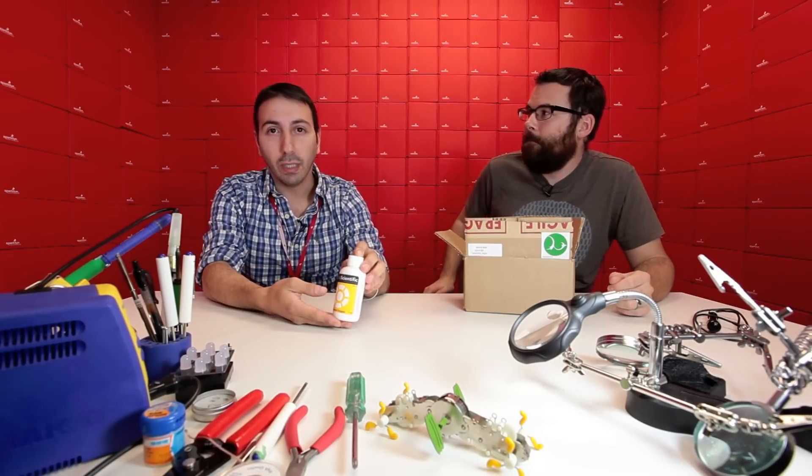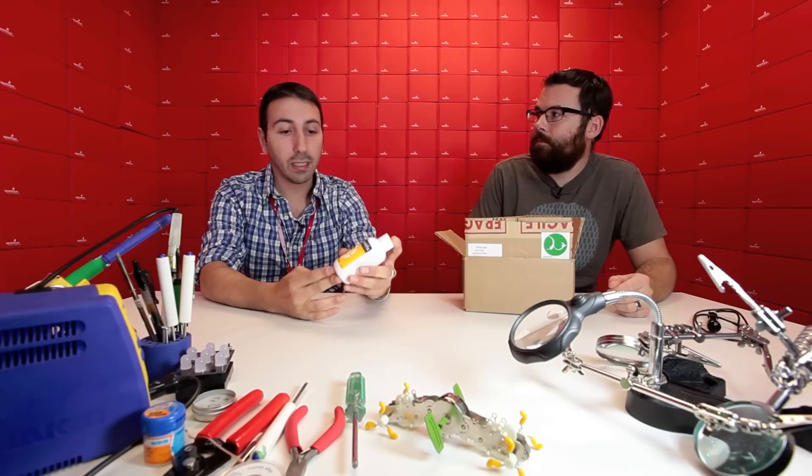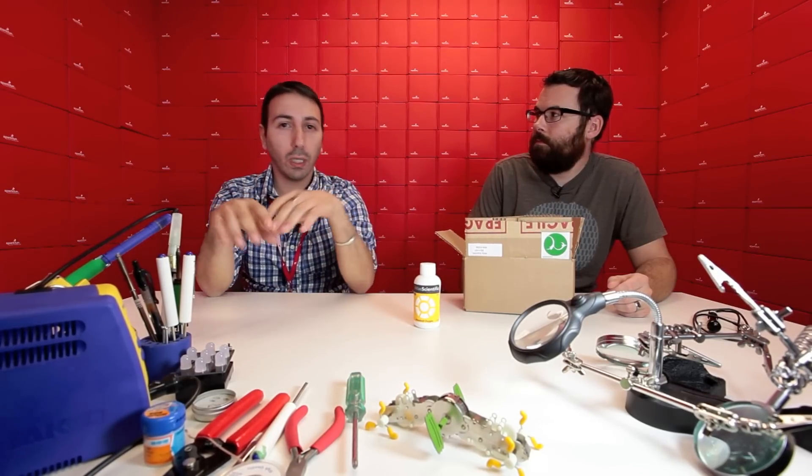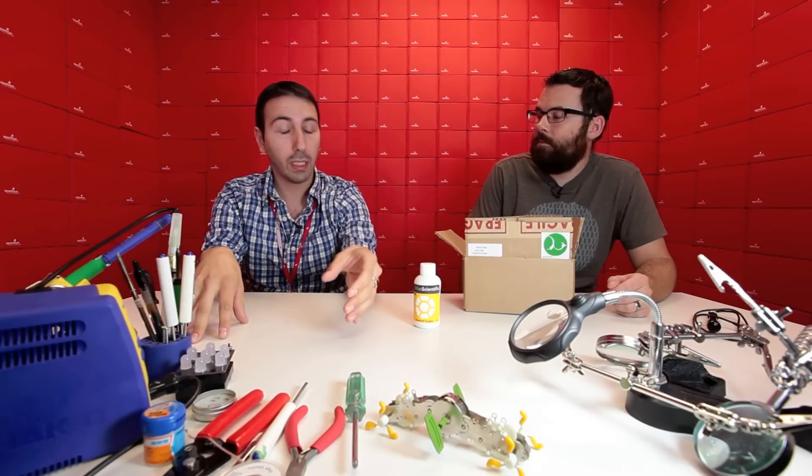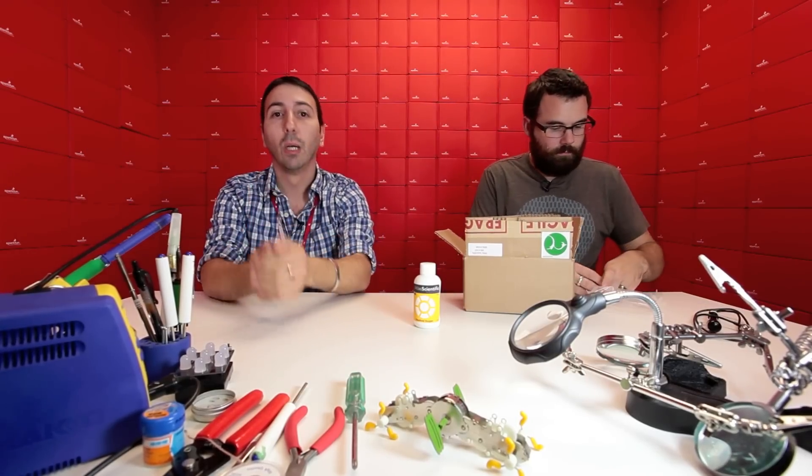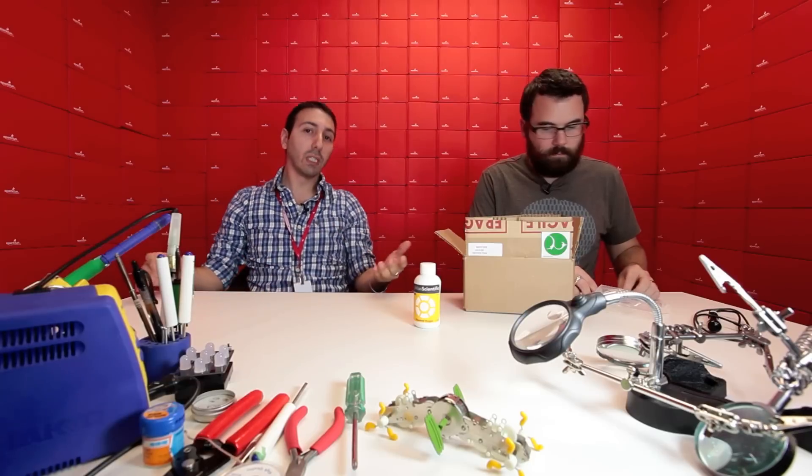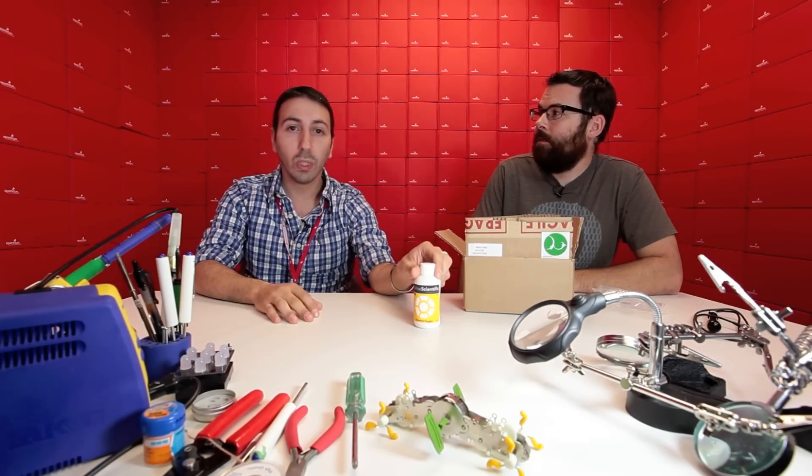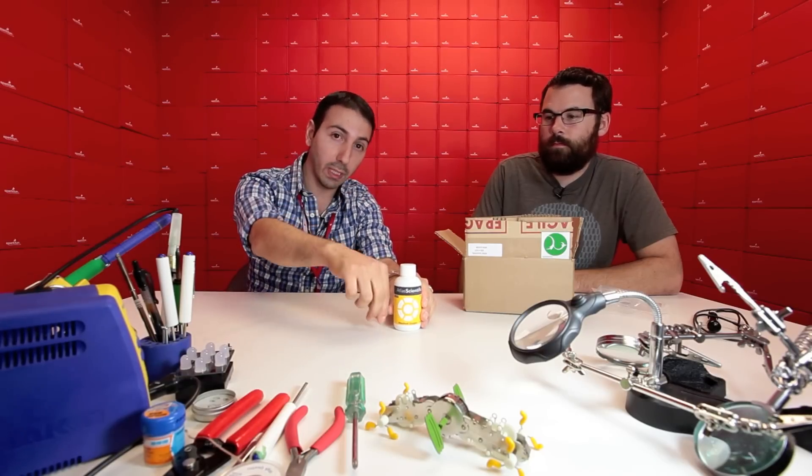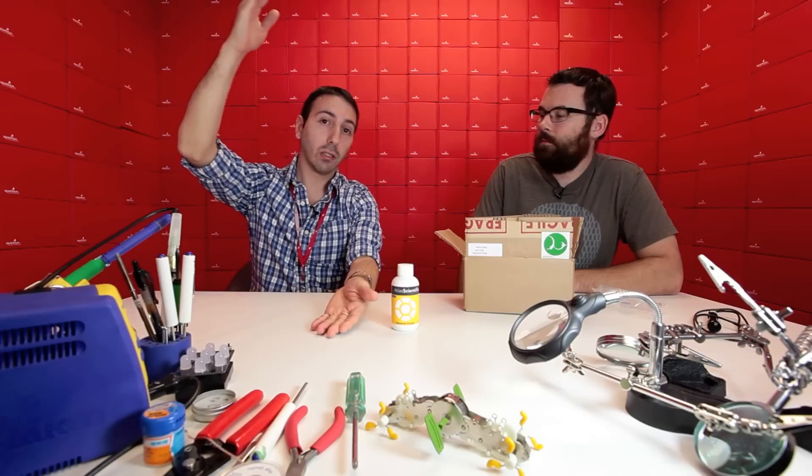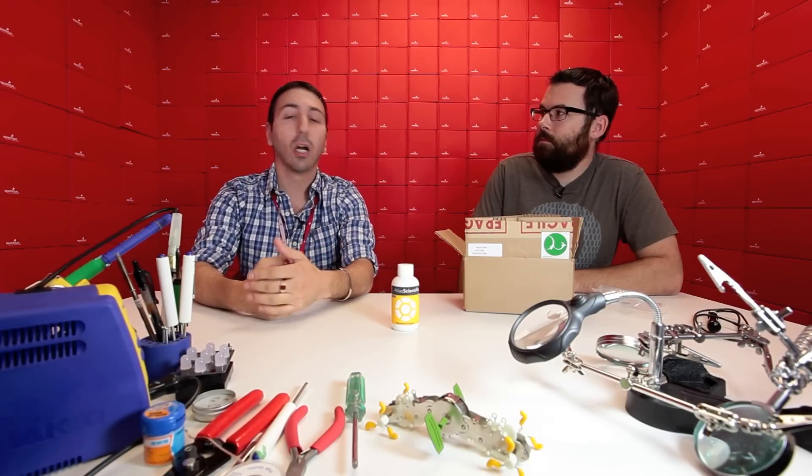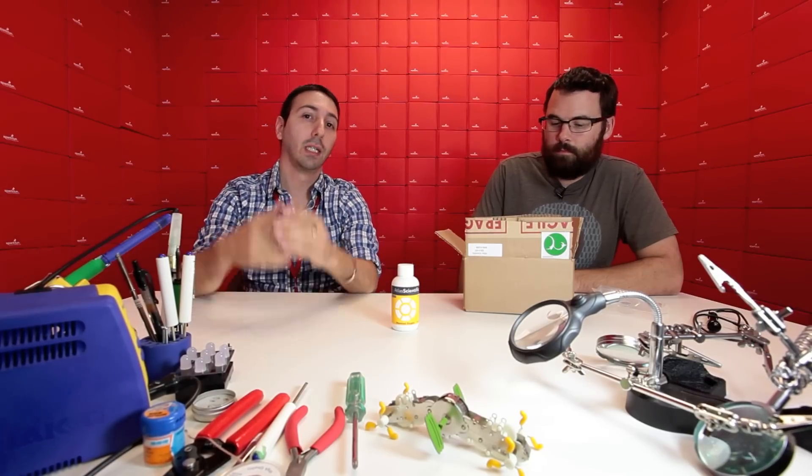Most of the equipment that we make comes with a calibration solution. And this is not. This is a confirmation solution. Because there's oxygen everywhere, when you connect the dissolved oxygen probe to the circuit and you start running it, you're going to see numbers coming out. And that's the oxygen level. But how do you know? How can you really tell that that's correct, that it's working properly? So what we did is we created this solution that has zero oxygen in it. And when you put your probe into the solution, you're going to start to see the oxygen level drop very quickly. And when you see that, it indicates, okay, this is working. I have it wired correctly. The data is correct.